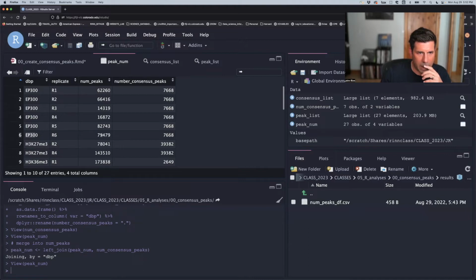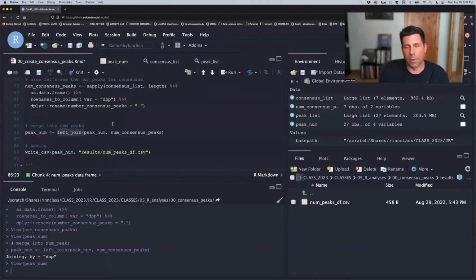So we can see that going from 79,000 to 7,000 seems like a lot, but some of them are 14,000 going to 7,000, which isn't too bad. So something to look at. It's a good way to QC your data, and that's what we're in the process of doing. If we just got fresh data, we want to look at reliable peaks and see how they changed.